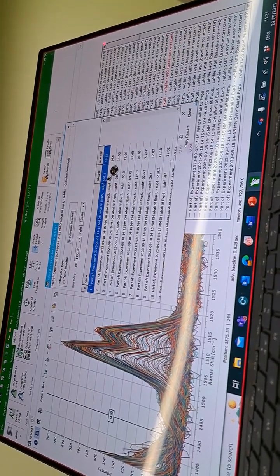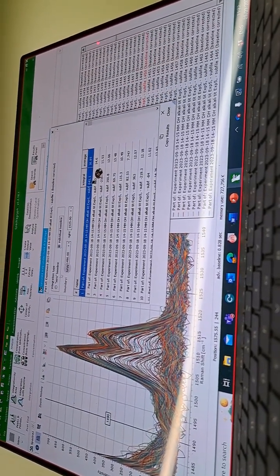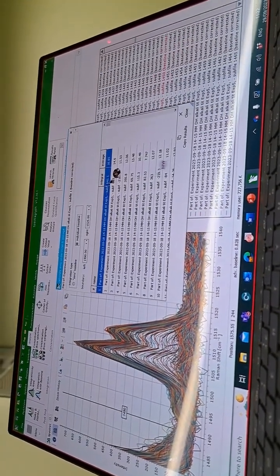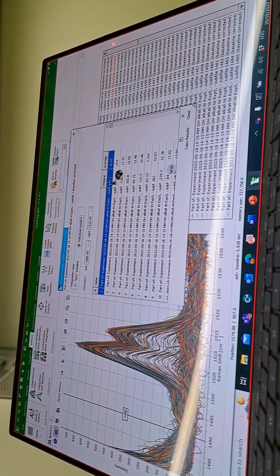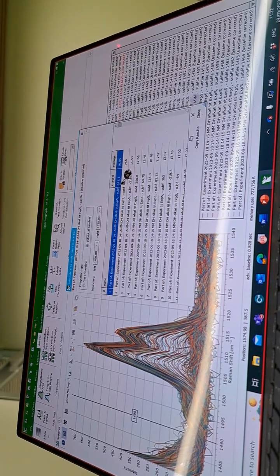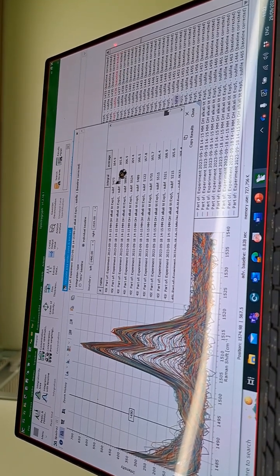So you use integration with baseline and then calculate the individual baseline. Okay. But in theory, they've already been baseline corrected. But it's difficult to know what it's exactly doing. Some of these are negative. Again, that's just noise. These are still probably fine.